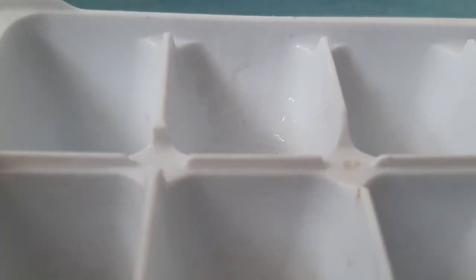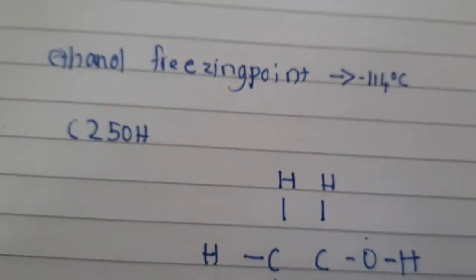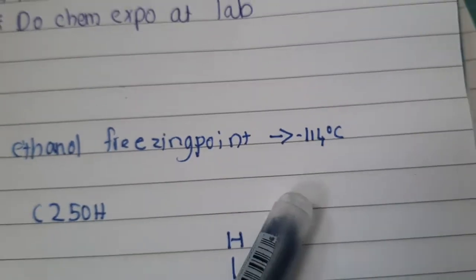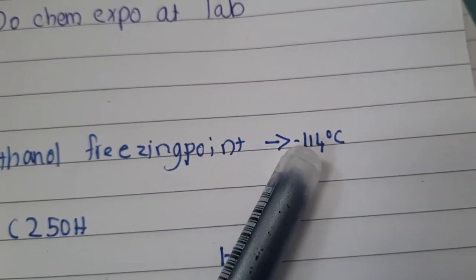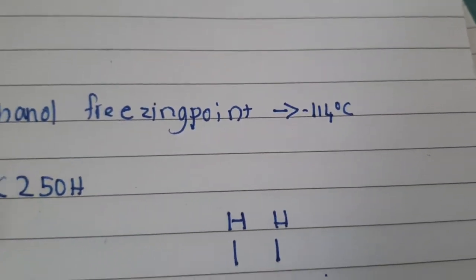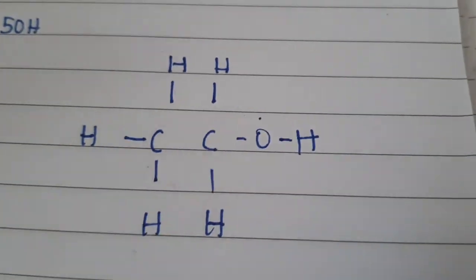So let us see why it didn't freeze. But it's cold. Let's see the freezing temperature of the ethanol. So over here you can see that ethanol's freezing point is -114 degrees Celsius, which my refrigerator cannot reach. And its formula is C2H5OH.